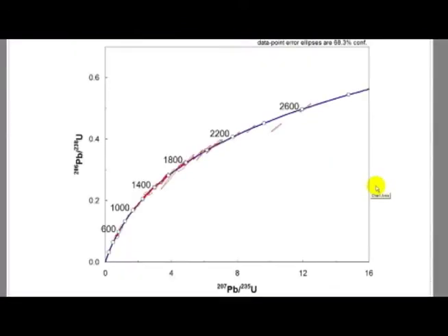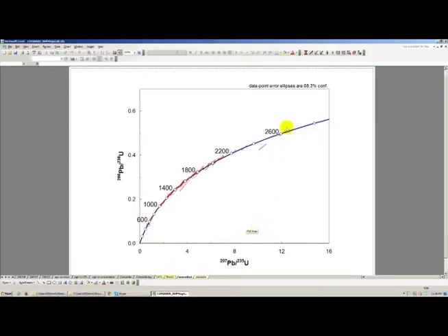These diagrams are scaled to accommodate all the data that you've highlighted. But say, okay, I'm not interested in just looking at the whole spectrum, but I only want to focus on these grains that are between 1 Ga and 1400 Ma. So that's the area of my interest.